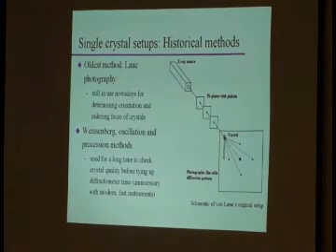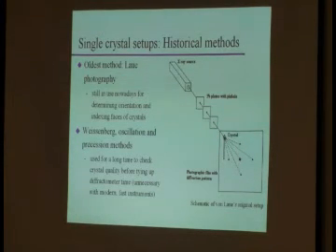How about single crystal setups? Well, there are quite a few different methods that people used. The oldest one was Laue photography. And funny enough, the oldest method is the only one that is still in use nowadays. Okay?